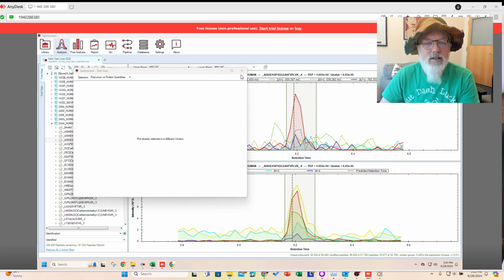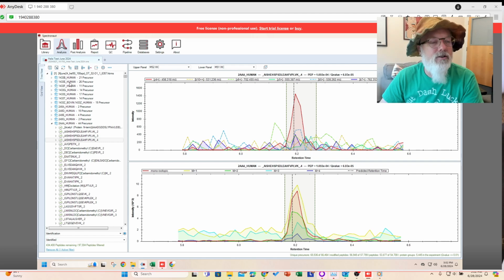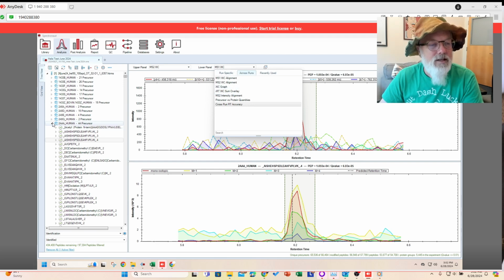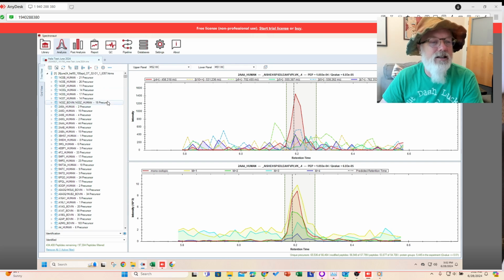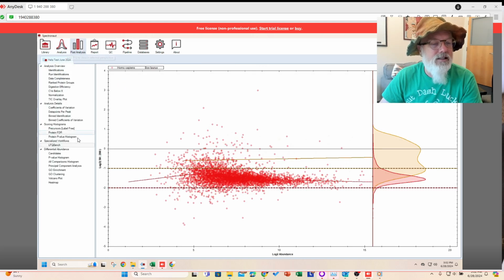Okay, and that's because I have 2 of these windows open. And you can see, it's better. Looks good. Okay, so that's how normalization works. We have a couple new features in Spectronaut. One I really like is the protein versus precursor quantity. I think that's about it. A lot of the other new features are the increase in sensitivity. We have been seeing 15 to 20% more IDs with 19 versus 18, which is really cool.